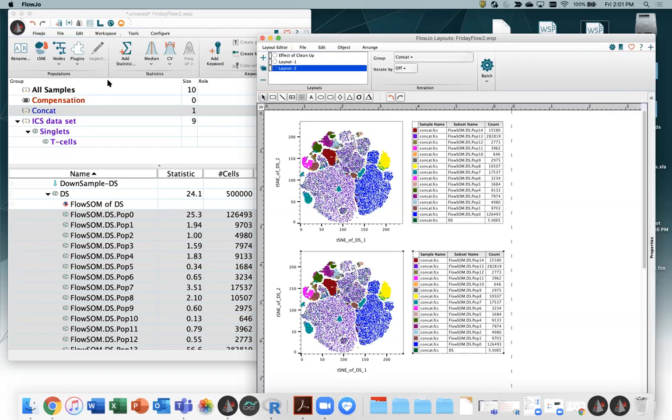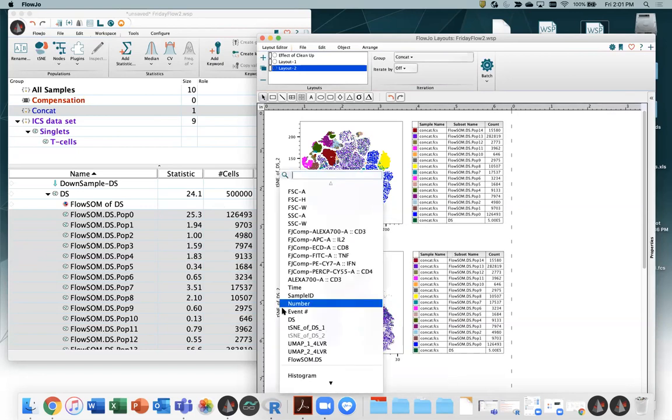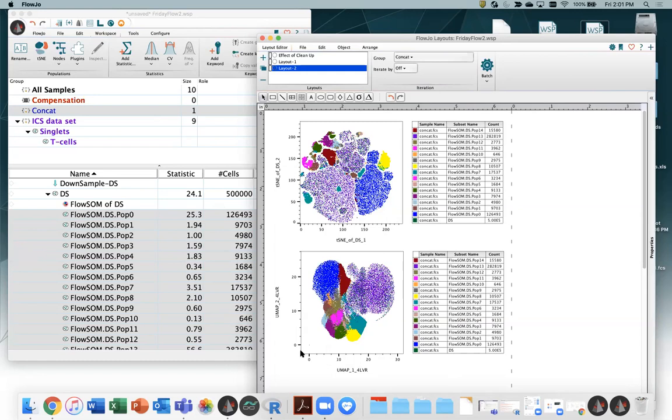Okay. All right, so I was just going to then switch to UMAP to compare these things. And I do think we've got two purples and a purple and a dark blue that are really similar colors. I'm going to switch in both of them and just make like a red. Oh, maybe that was mostly all one cluster and they're just kind of overlaid a little bit. Oh, all right, never mind. They are mostly one cluster.